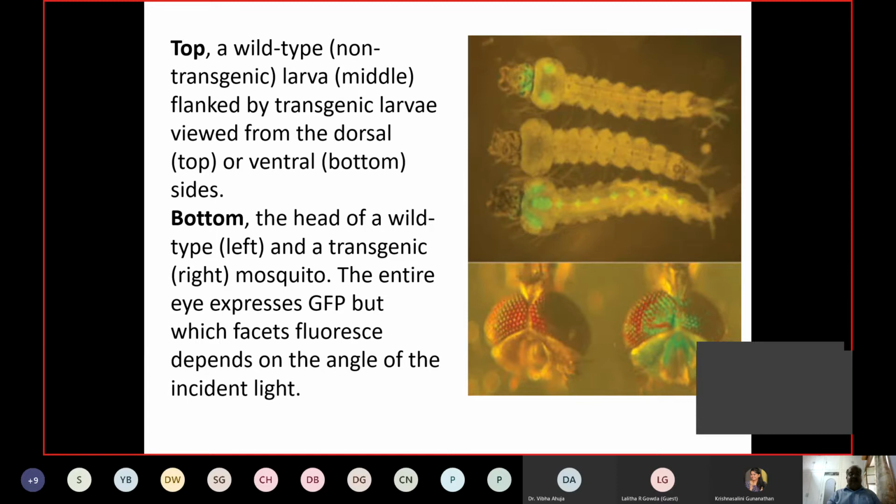In the bottom picture, you can again identify from the head of the mosquito which emerges, that the mosquito having fluorescent is clearly visible on the right side in comparison to the one which is not having any glow on the left side. So by having the fluorescent dyed larvae, we can identify them very easily from those of non-GM mosquito larvae.